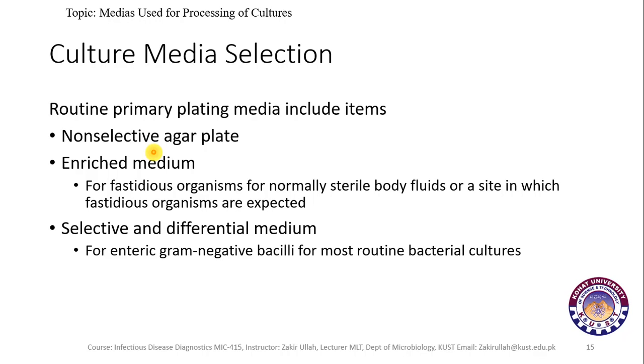And then if fastidious organisms are suspected, or the sample is from sterile body fluids or sterile body sites, enriched media is required for that kind of sample.